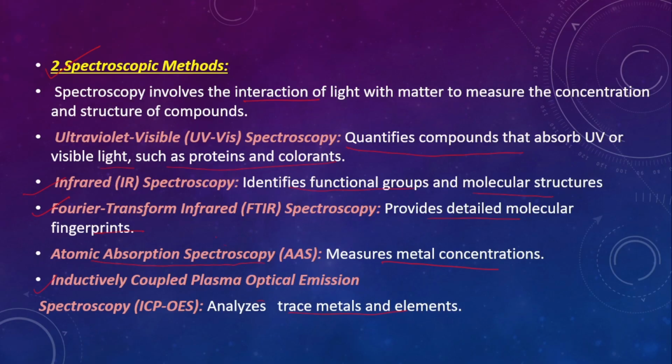There are also some other spectroscopic methods, like nuclear magnetic resonance spectroscopy, which gives detailed structural elucidation of complex molecules like lipids, carbohydrates, proteins, and helps in determining food authenticity, like the origin of wine and olive oil by fingerprinting. It is also used for analysis of metabolites, monitoring the fermentation process, and quantification of minor compounds like organic acids, amino acids, sugars, etc.